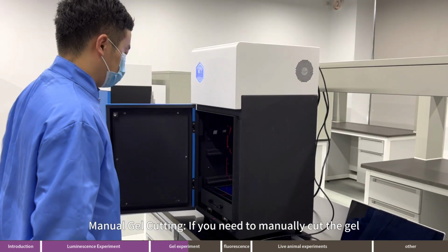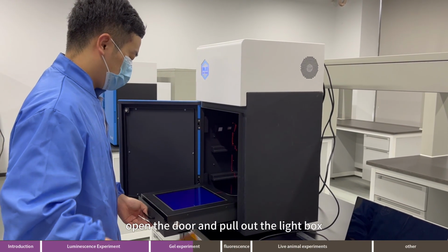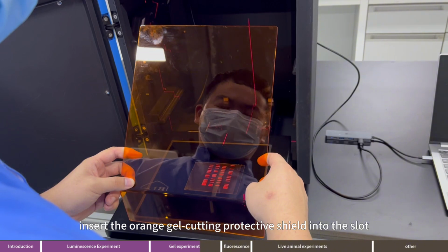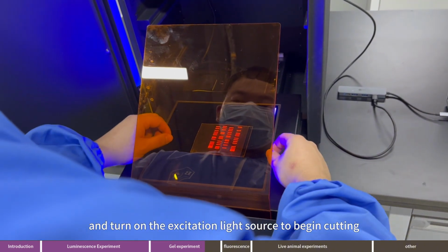Manual gel cutting. If you need to manually cut the gel, open the door and pull out the light box. Place the sample on the glass panel of the transillumination platform. Insert the orange gel cutting protective shield into the slot. And turn on the excitation light source to begin cutting.